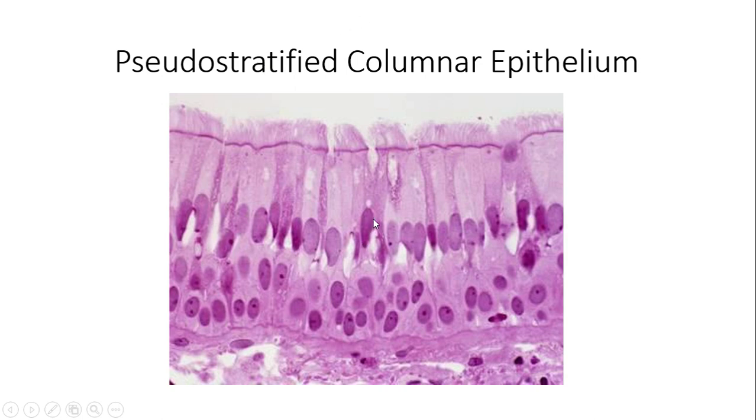But the main thing that's important about looking at pseudostratified columnar epithelium is, actually I forgot to write it here, but it's obviously pseudostratified ciliated columnar epithelium. You see all these beautiful cilia here. The main goal of these cilia is just to move mucus along, let's say, the respiratory tract. So that's why they have these cilia here. So the main thing you want to look at for pseudostratified is these nuclei with their top to bottom arrangement, and they're always going to have that cilia.